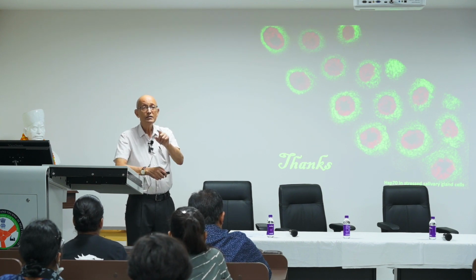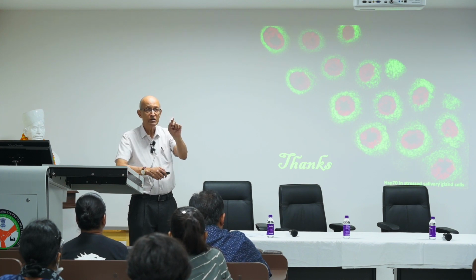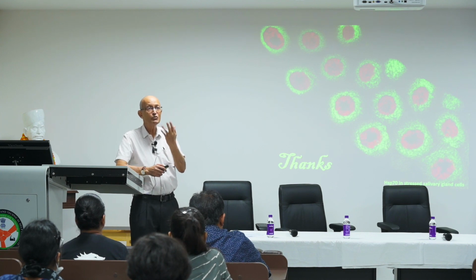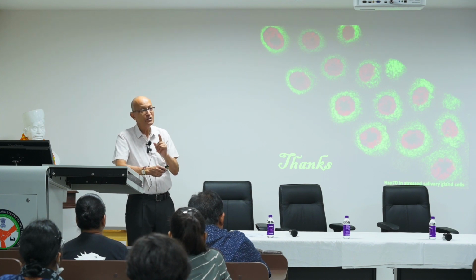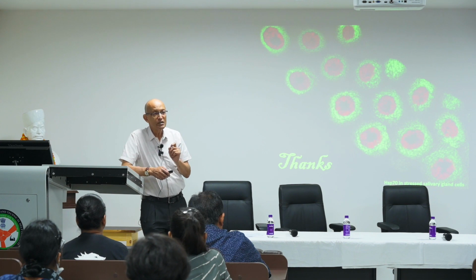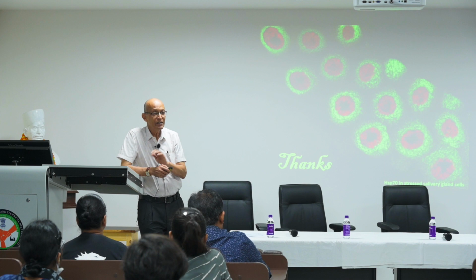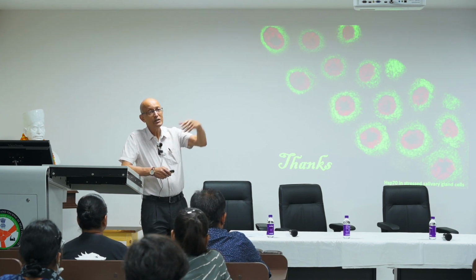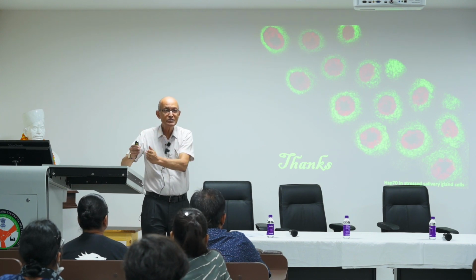Okay. Then in that case, wherever that happens, only that point will give fluorescence, the rest will not. Now, where is the highest probability of two photons hitting the same electron? Think of it. One simple answer I'll give you is, if any of you have tried to burn a piece of cotton using a magnifying lens with sunlight. Any of you have done this? Now, does it burn wherever you put the magnifying lens? The magnifying lens must be focusing.